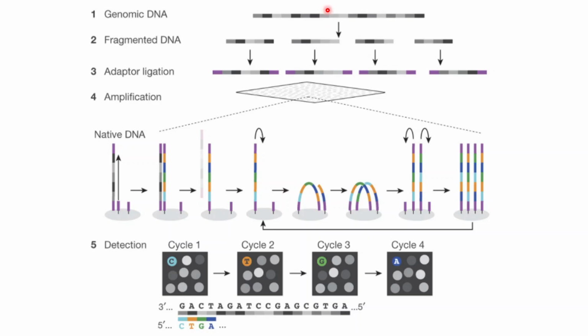Then you have to mix all those reads, align or assemble them to generate the complete genomic DNA. So you will get the reads in the form of a file. We have just downloaded that file. We got the forward read as well as the reverse read from the SRA database using the SRA toolkit in the Bioconda environment and everything. So from that you get the reverse read and forward read.